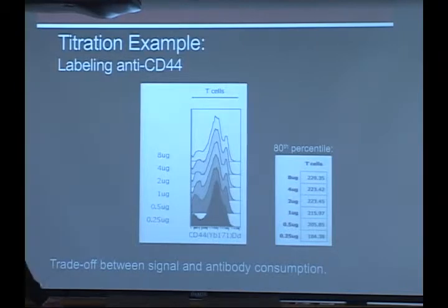These are the easier examples that I've showed you of cell surface proteins. Things get a little bit trickier when you're trying to validate antibodies against, say, a phosphorylated signaling epitope, which is what you'll be doing a lot of in the phosphoflow course. Obviously, that's why you're here, to learn phosphoflow.